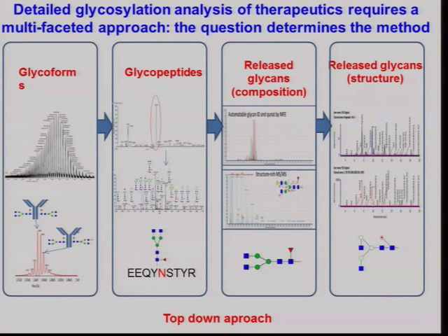So these are the monosaccharide residues. Here's the anomericity, dotted lines or straight lines, and the angle, as I showed yesterday, defines the linkage.